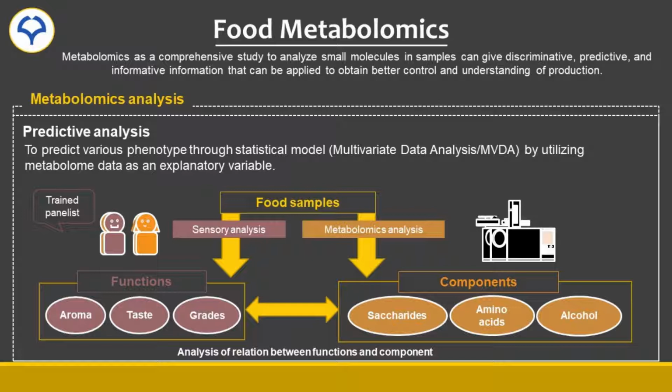First, let's talk about predictive analysis. Metabolomics enable researchers to predict various food phenotypes through statistical model. This is done by utilizing metabolome data as explanatory variables and sensory analysis data from trained panelists as response variable.